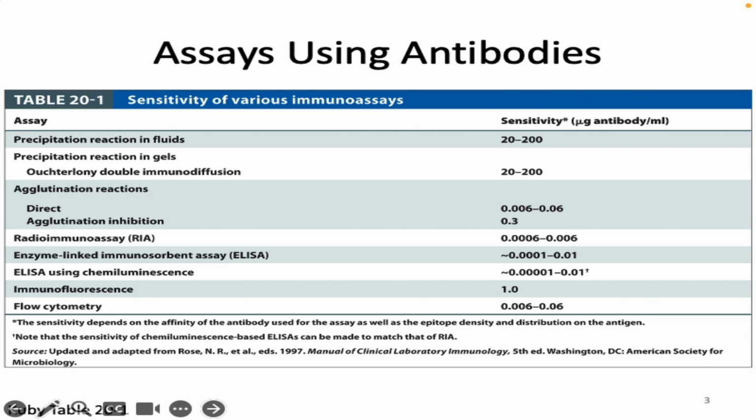So you guys have seen a Western blot before. Sometimes we can do, so this of course requires you to have a protein sample you can run on a gel. You could also have samples in different formats. So there's one that we have called an ELISA, where we just use a little well of a plate and we put the sample in the well of the plate. And then we again bind our antibodies to it and see, will the antibody bind or not? And so it's conceptually the same kind of thing.